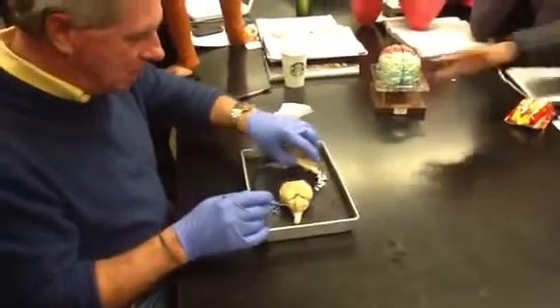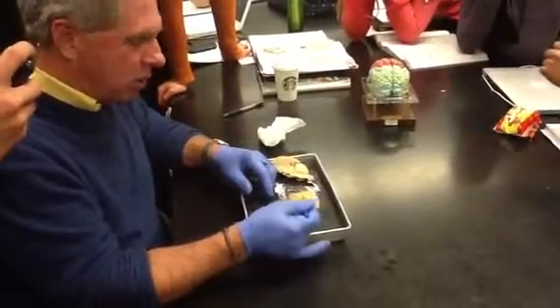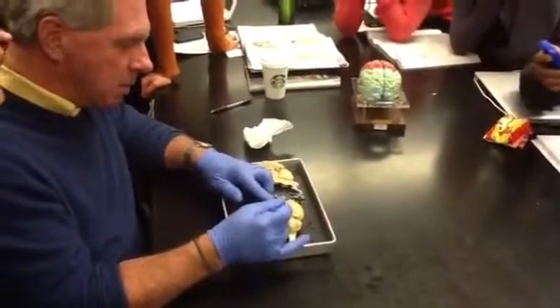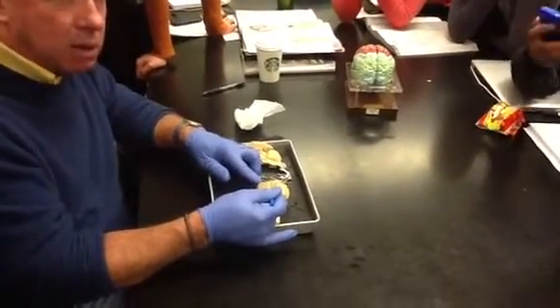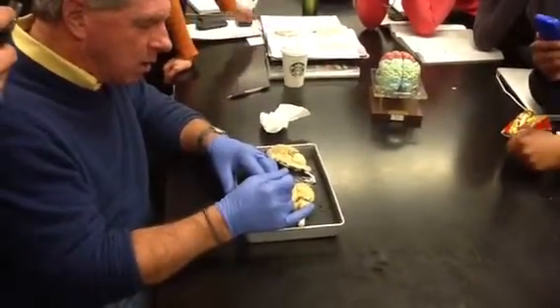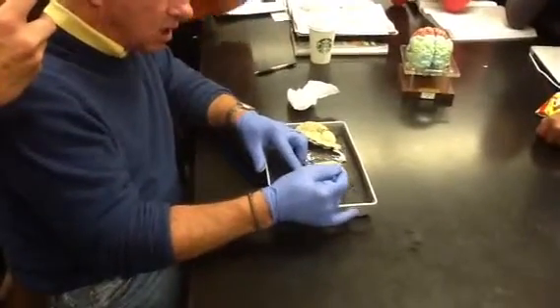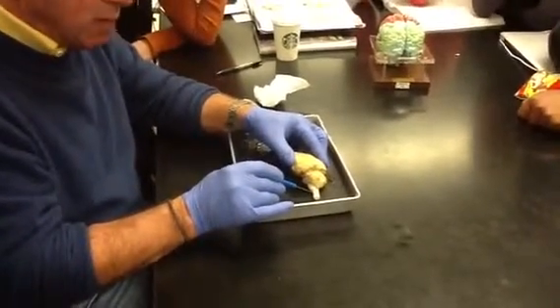All right, so this is obviously the whole sheep brain, and you can see the cerebral hemispheres and the longitudinal fissure right down the center. The shiny surface to it is the pia mater, the stuff that adheres to the surface of the brain. The little elevated areas are the gyri, and the little spaces in between are the sulci. So this is the cerebrum. Back here is the cerebellum, and then of course right here is the spinal cord.